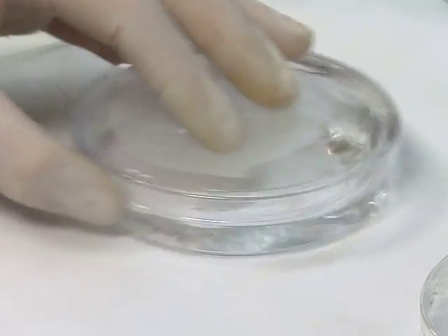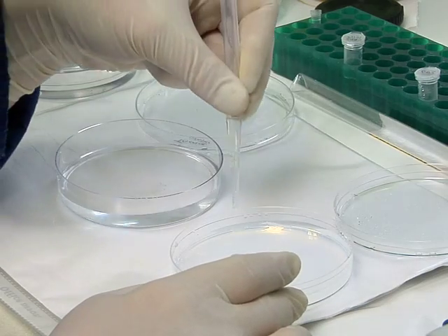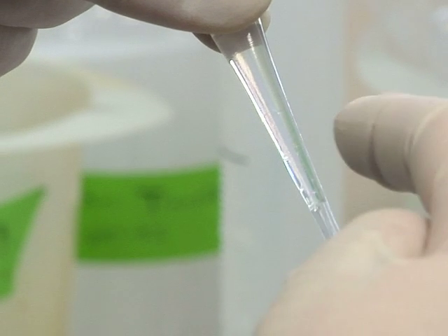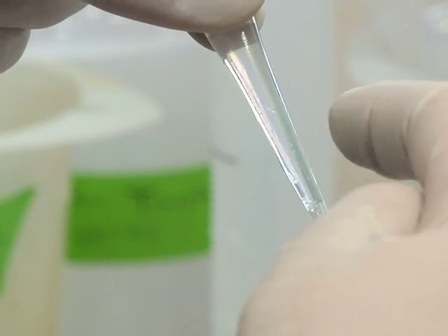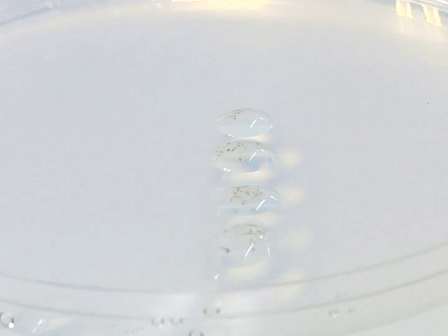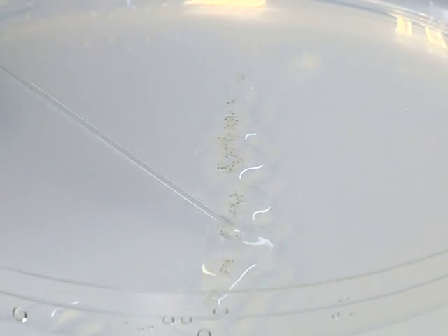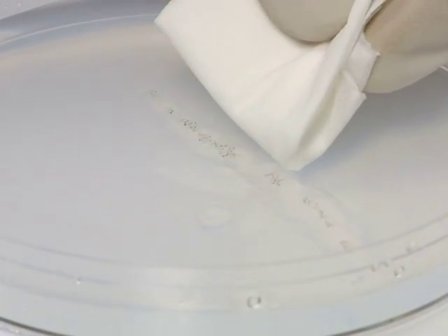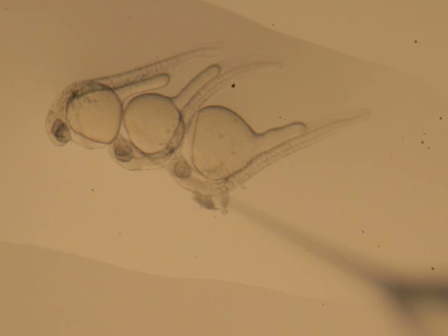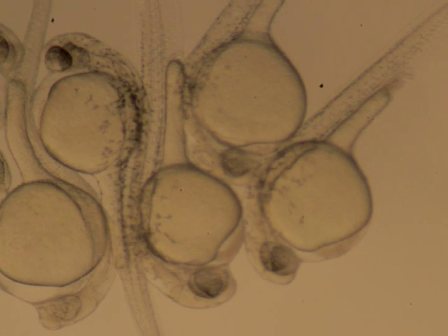Once the microscope is set up and the fish are anesthetized, swirl the dish to draw the fish to the centre and take them up into a transfer pipette. Carefully tap the side of the pipette so that the fish settle at the tip. Then, using as little volume as possible, gently deposit the fish onto a low-melt agarose injection dish pre-warmed to 28 degrees Celsius. Using a smooth glass rod, carefully line the fish up, then with a paper towel, remove as much liquid as possible from the dish. Place the agarose dish with fish under the microscope until both the needle and first fish are in clear view. Ensure that each fish is still alive by observing the presence of a visible heartbeat; if it is dead, discard it and move on to the next one.